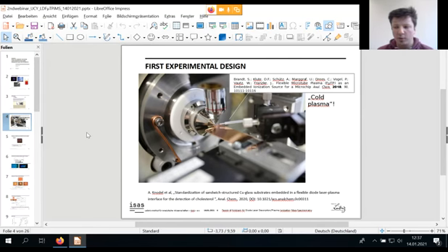I'm not very sure how much the laser diode controller costs and how much you have to pay for laser operation, but I think it's not that much because you do not need high voltage. I think it's about 5 volts for operation of the Peltier element, and up to 1 ampere for the laser diode, so it shouldn't be that much, of course.